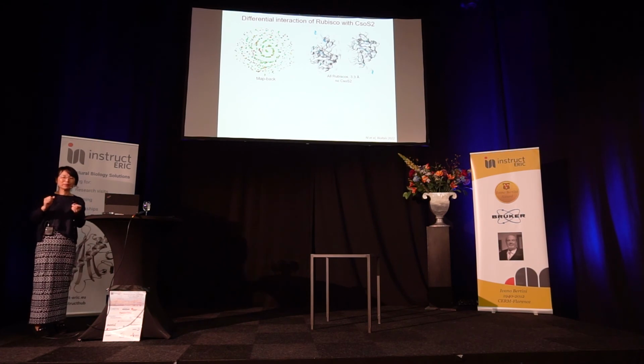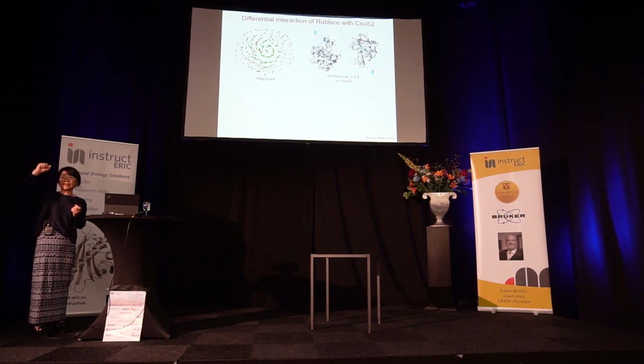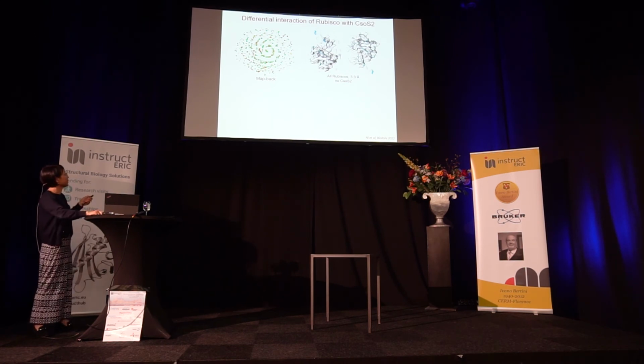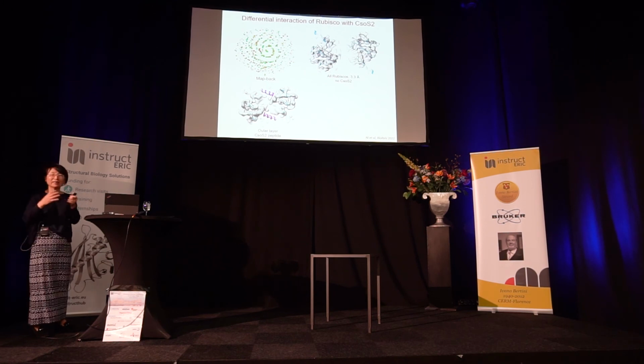We were wondering, we know there are in vitro structures, a complex with the Rubisco crystal structure with the CsoS2 fragment bound, and that there are six supposed to be sitting in this groove here. But we don't see CsoS2. What is happening? CsoS2 is supposed to have one end to the shell and another end to the Rubisco. Then we started analyzing the subpopulation of the Rubisco within the alpha-carboxysome. So we first, the color doesn't show, I cannot see color very well, but the supposed shell indicating a shell.